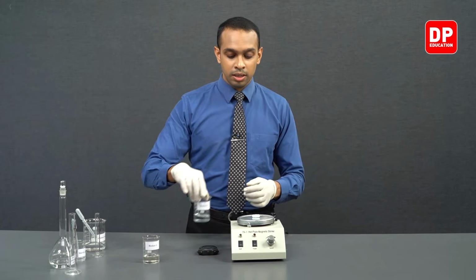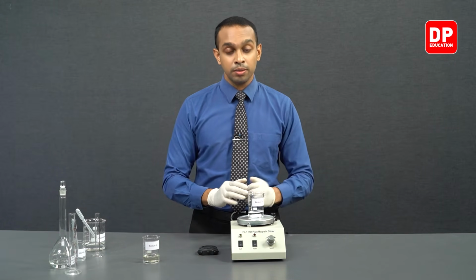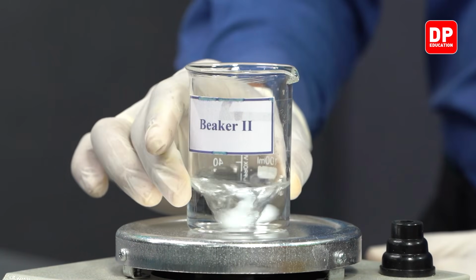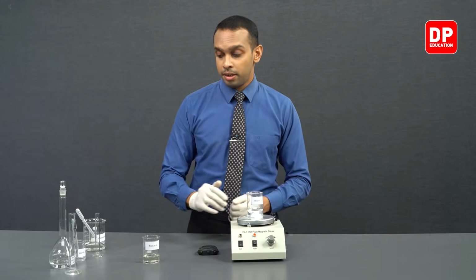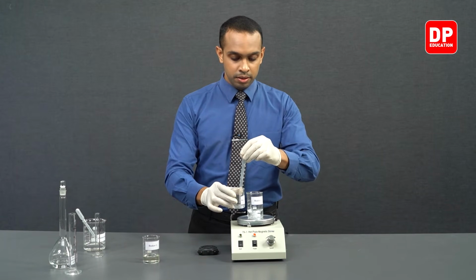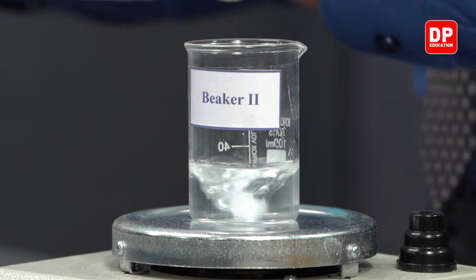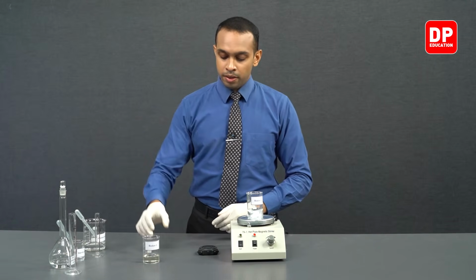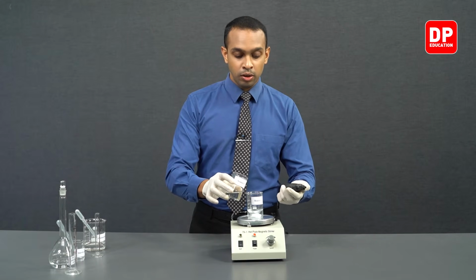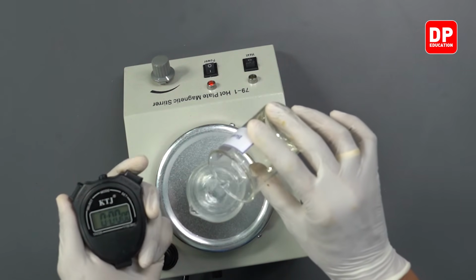So now students, let's place this beaker 2 on our magnetic stirrer, and then we'll turn on the magnetic stirrer, and after that we can add our starch solution as well. We have to add a few drops of starch solution, around 5 drops. Then we will prepare our stopwatch, and we will add the contents of beaker 1, which is Fe3+ ions, into the beaker, and as soon as we add, we will start our stopwatch.